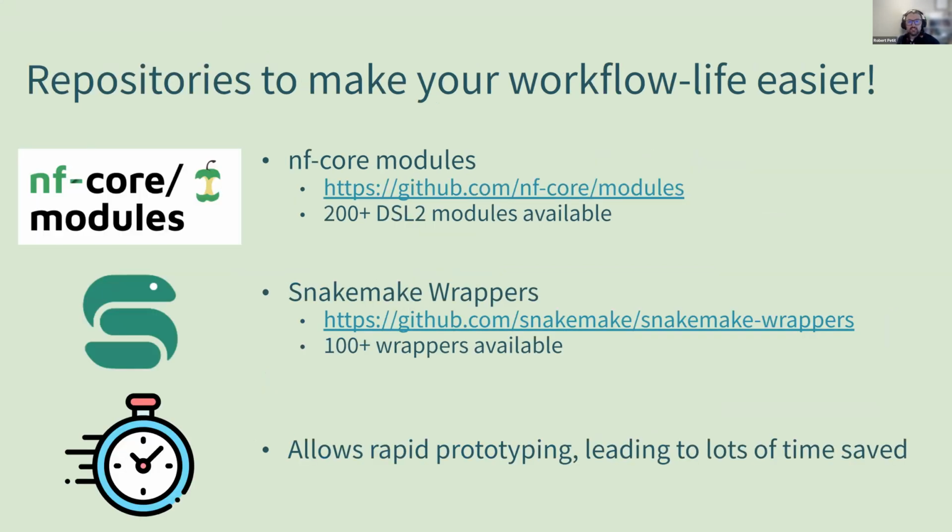One of the things Andrea highlighted too is the one thing that makes DSL2 and Snakemake wrappers really great, and Nabil mentioned it too: these modules are plug and play. If I make one, I can pass it to you, and theoretically you can integrate it into your workflow as well.